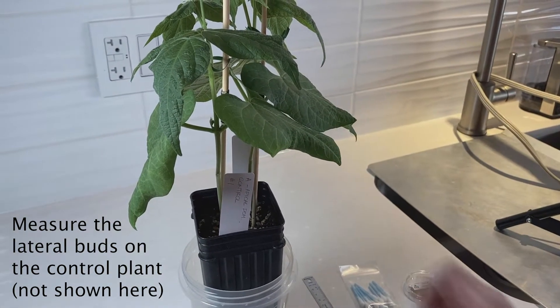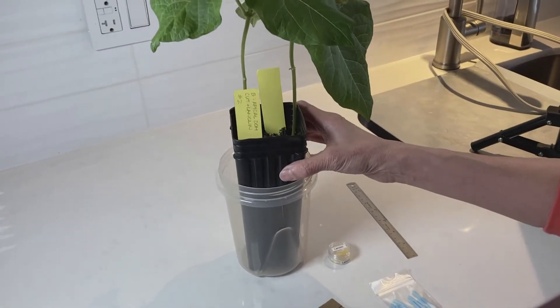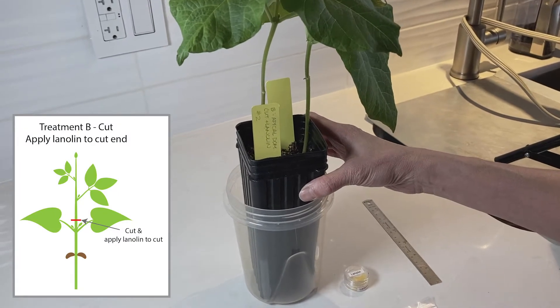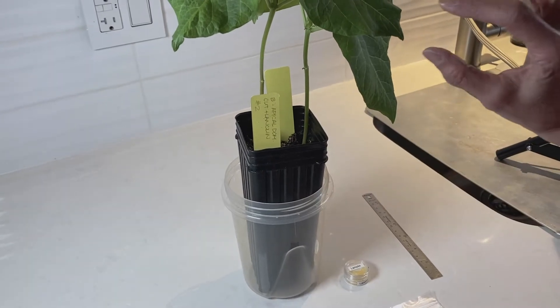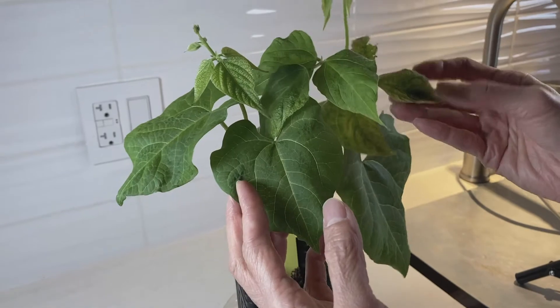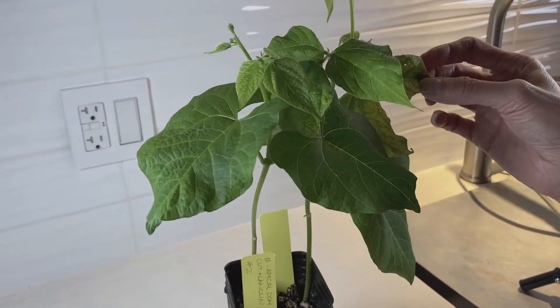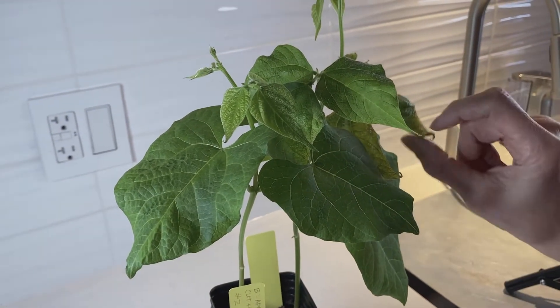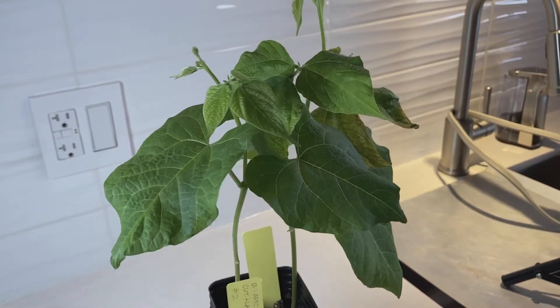The control plant we don't do anything to. Now I have the pots chosen for treatment B, which is cut and apply lanolin to the cut end of the stem. Here I've got a pot with two plants — one looks pretty good and the other is a little brownish; we think it may have a fungal infection. I'm going to try to use one healthy plant and one not-so-good plant for each treatment, depending on how many plants I've got.